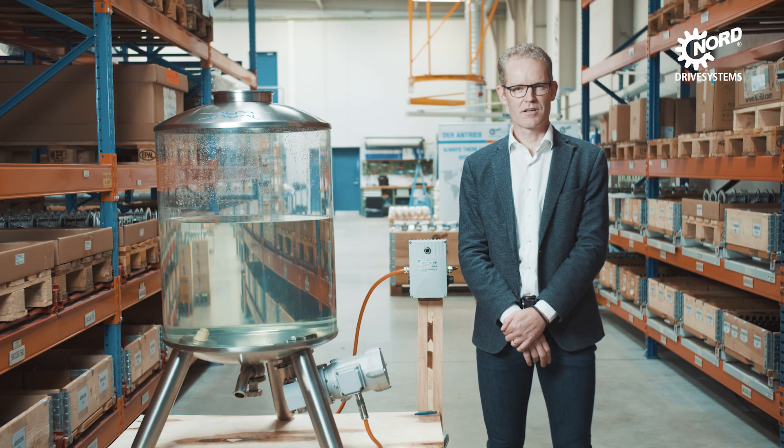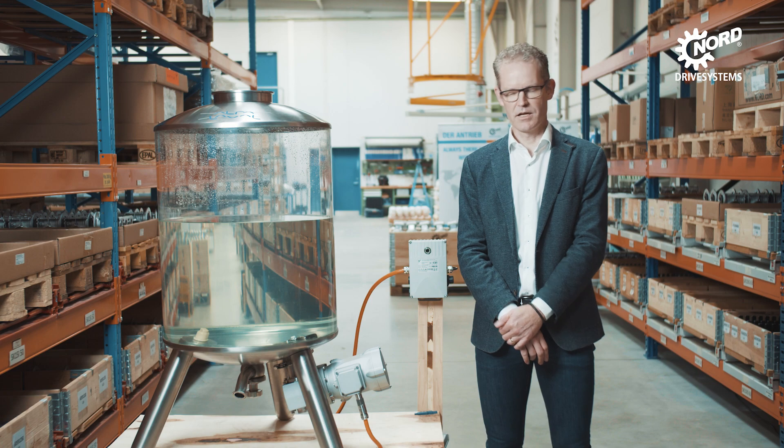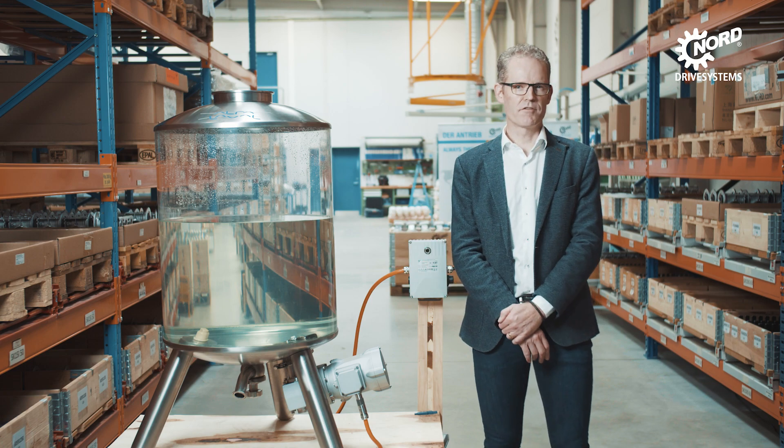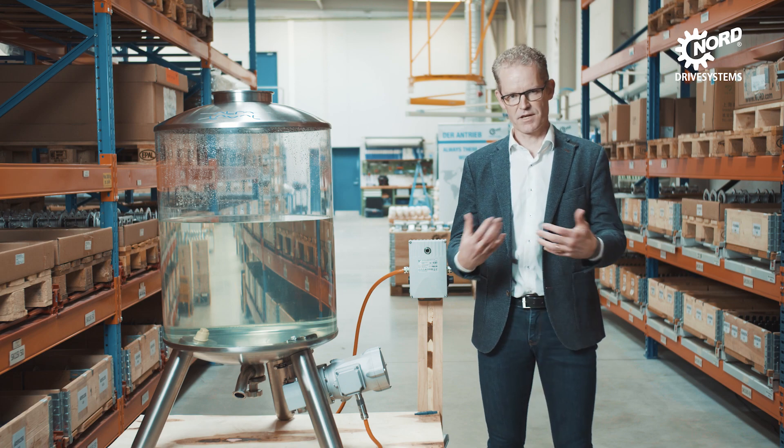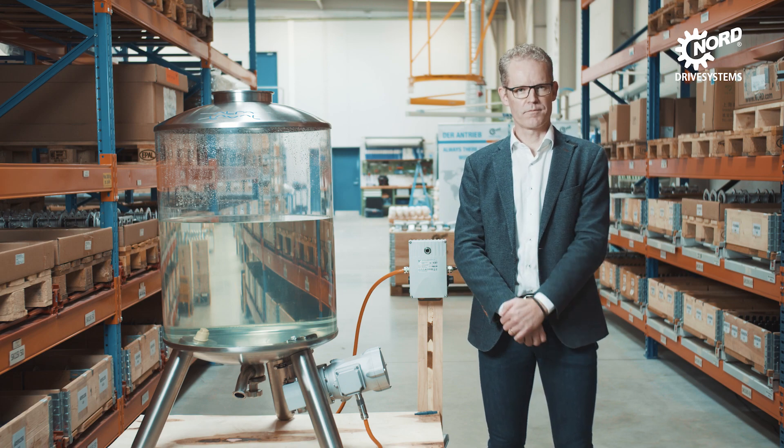My name is Christian Jørgensen. I work for Alfa Laval as a global launch manager for the levitated magnetic mixer, which is called the Levimag, shown here. I have the global responsibility for this particular product in terms of sale and technical support.